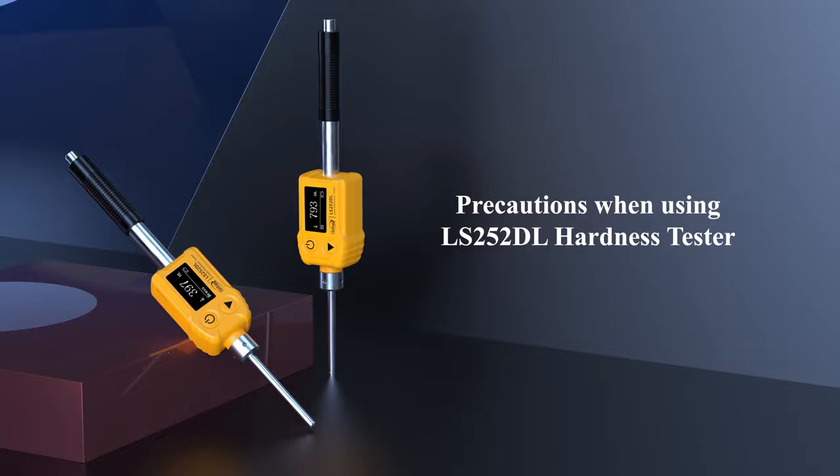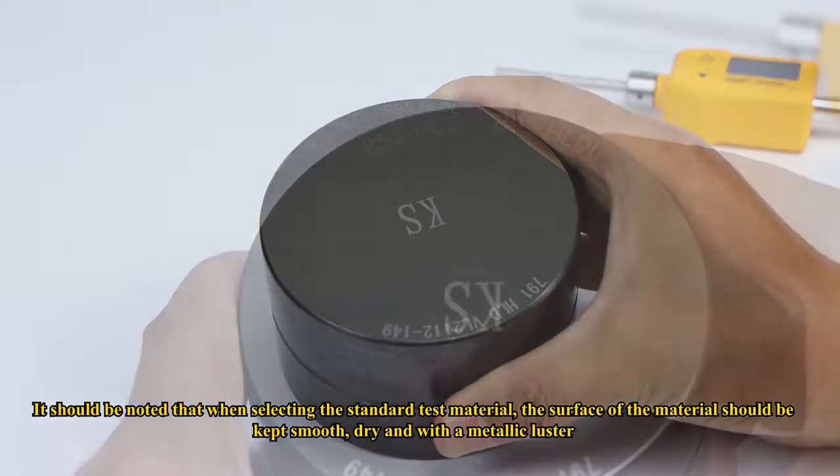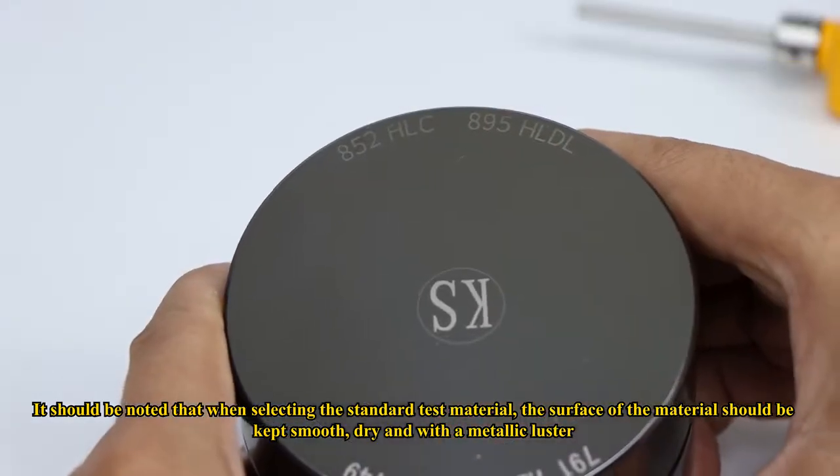Precautions when using the LS252 DL hardness tester: When selecting the standard test material, the surface of the material should be kept smooth, dry, and with a metallic luster.